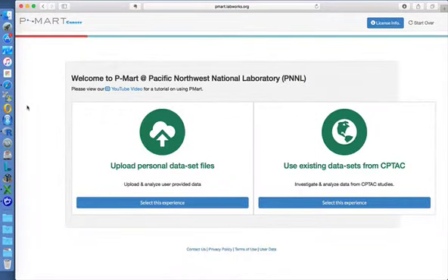Welcome to PMART. This video will describe the file requirements when uploading personal data files for analysis. A written version of the file requirements is available on the PMART website once you select the Upload Personal Dataset experience. Additional tutorial videos on uploading personal datasets and performing an analysis are available on our YouTube channel.